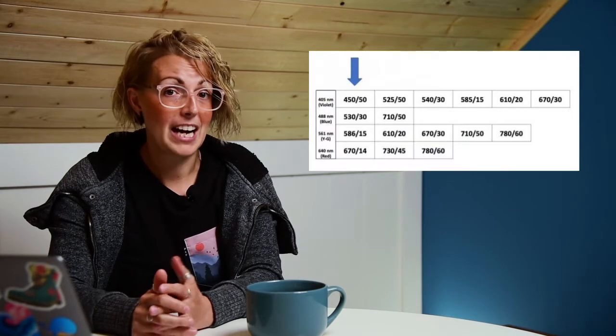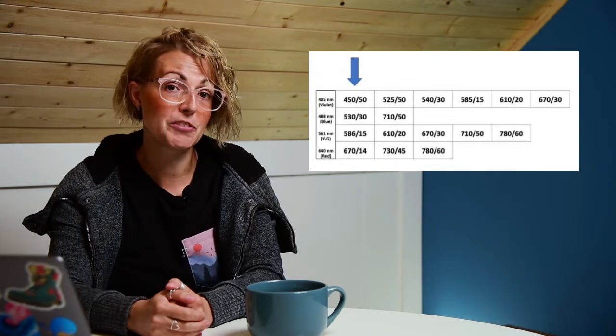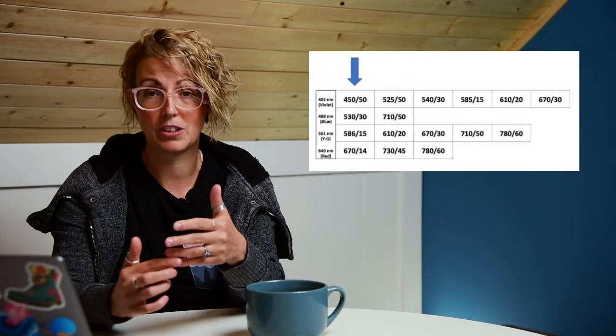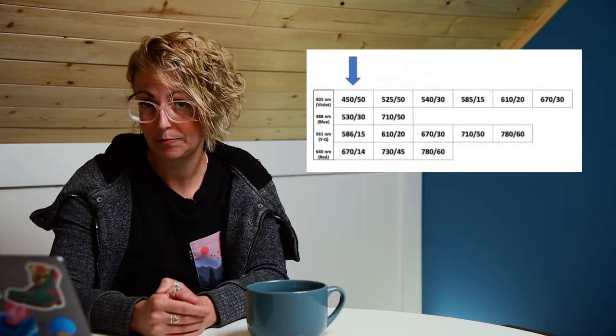After you've factored in fluorochrome brightness, the next thing you want to do is reduce the spillover. Essentially, this means spreading your fluorochromes out as much as possible. The easiest way to do this is starting by selecting a fluorochrome off of each laser line. Generally, the first fluorochrome off of each laser line will be the brightest one. So if we have a standard, say, 4 laser instrument, we'd want to choose the first fluorochrome available off each of the 4 lasers. And that would give us a really easy way to build a 4-color panel.